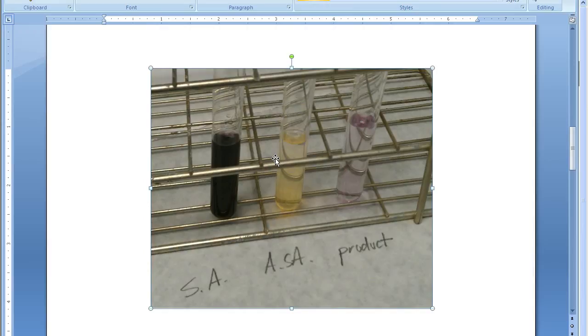One of the interesting things about the UV-Vis spectroscopy is it is much more sensitive at detecting this purple color or any color, for that matter, than our eye. So we might be able to see very small amounts of impurity in what, to our eye, looks like a rather pure sample.